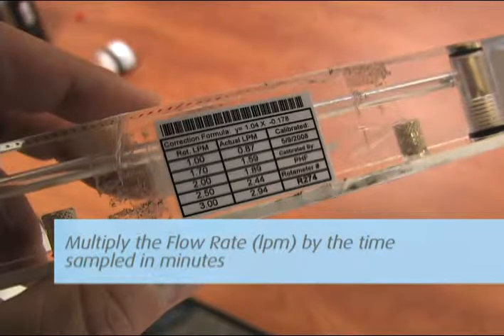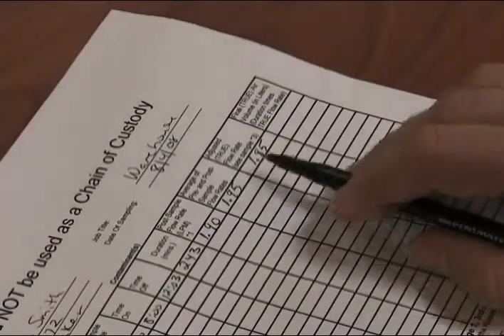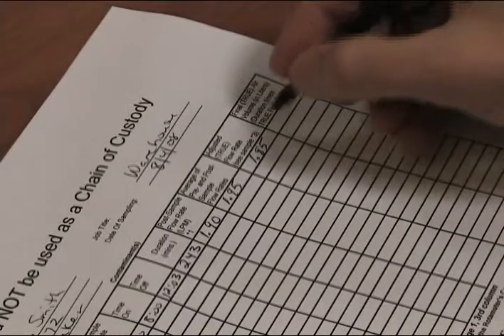Multiply the flow rate in liters per minute by the total time sampled in minutes to get the air volume in liters. Record the total liters on the field pump data sheets and the chain of custody.